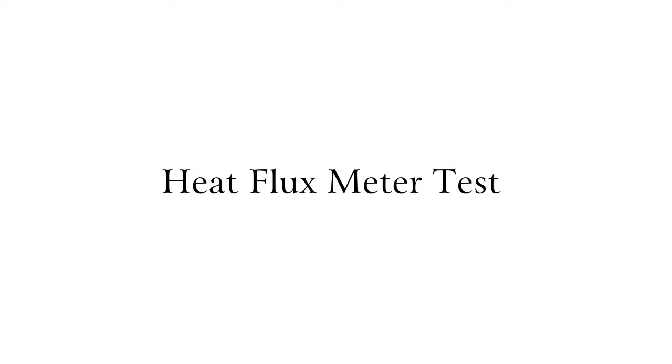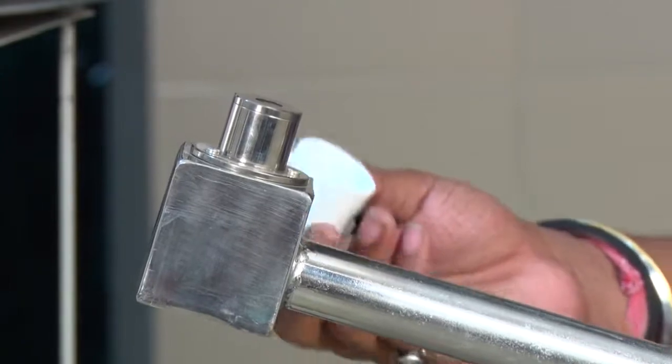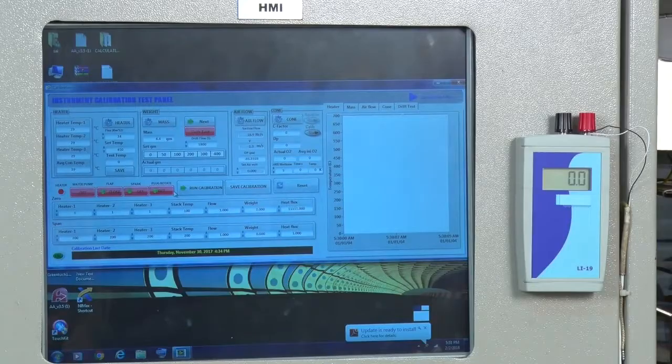The third test is the Flux Meter Test. Here is the flux meter, which is water-cooled from inside. We place the flux meter on the retainer frame so that it can display the cone heater flux rate, which is indicated on this indicator.